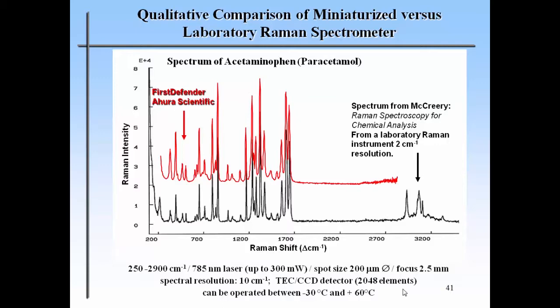And a colleague who worked for this company, it is now sold by Thermo Scientific, but originally it was designed by the company Ahura. And this colleague from Ahura told me they had sold 3,000 systems to the soldiers in Afghanistan in order to detect materials.